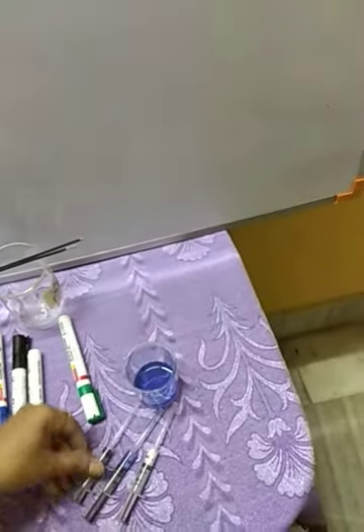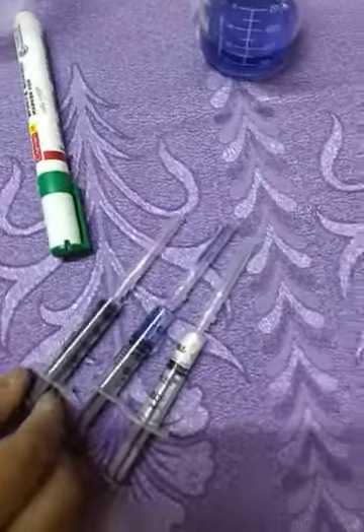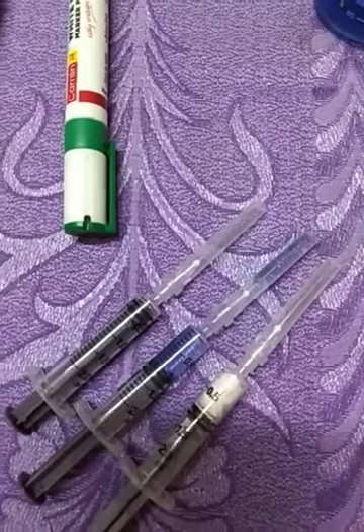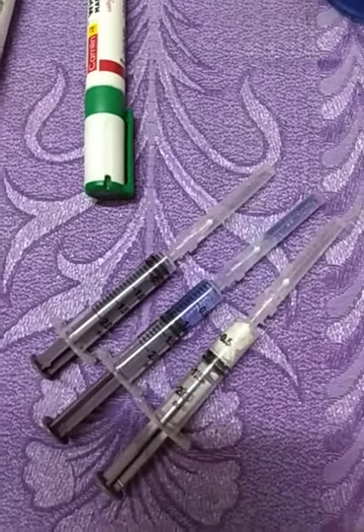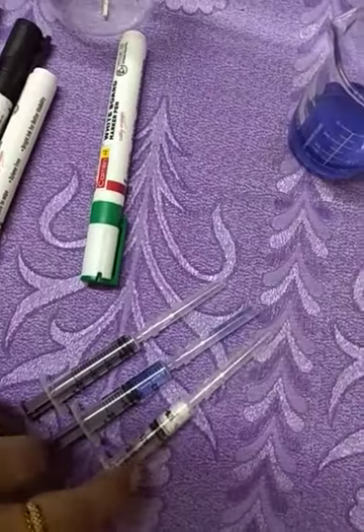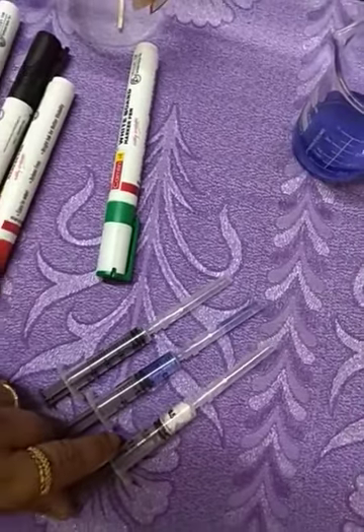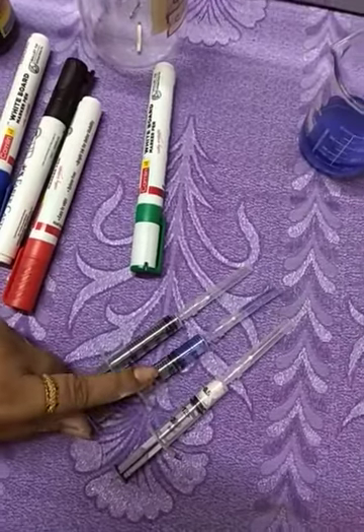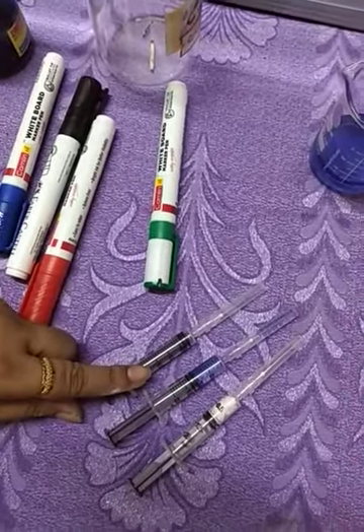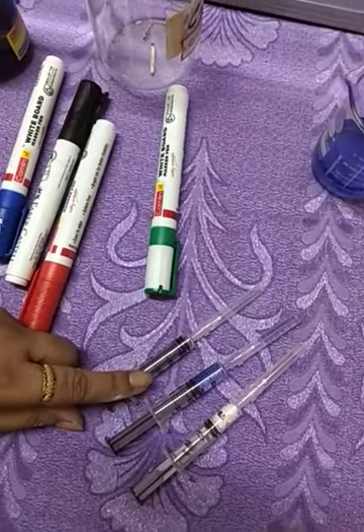So I'm keeping all these three here together so that you can easily understand them. See, these three different results we have got for these three different states of matter. This is for solid, which is almost incompressible. This is liquid, which is slightly compressible, and this is gas, which is easily compressible.